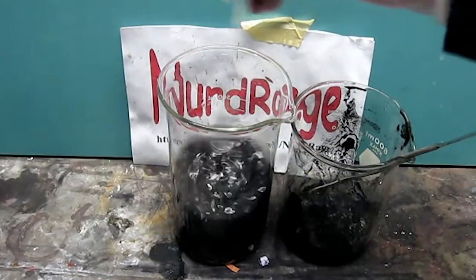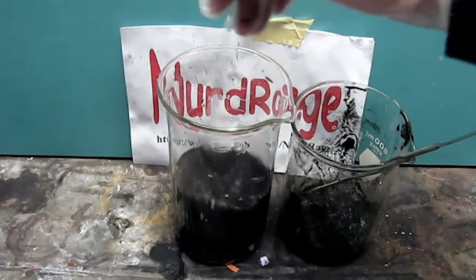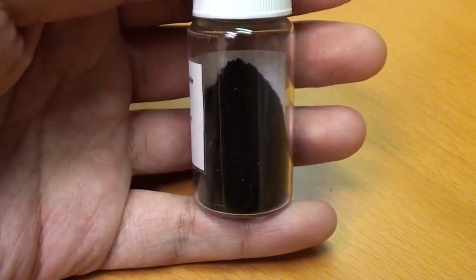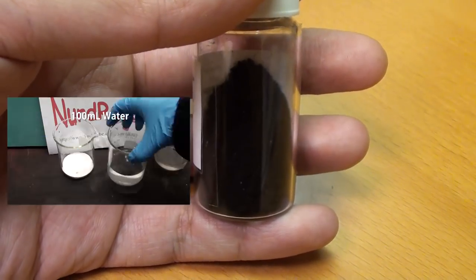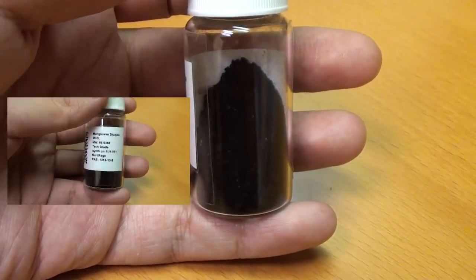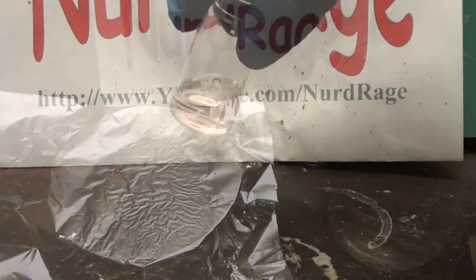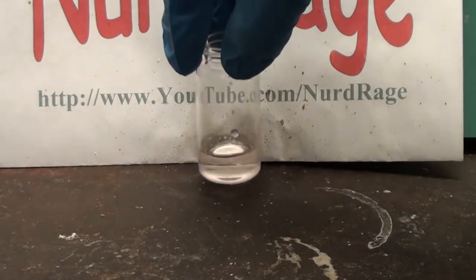The source of the problem with the original method was that we used crude manganese dioxide from batteries. But in another video I showed how to make highly pure manganese dioxide from potassium peroxymonosulfate and purified manganese sulfate. Today we're going to revisit manganese dioxide electrodes, but this time ensuring we make pure manganese nitrate at the start.